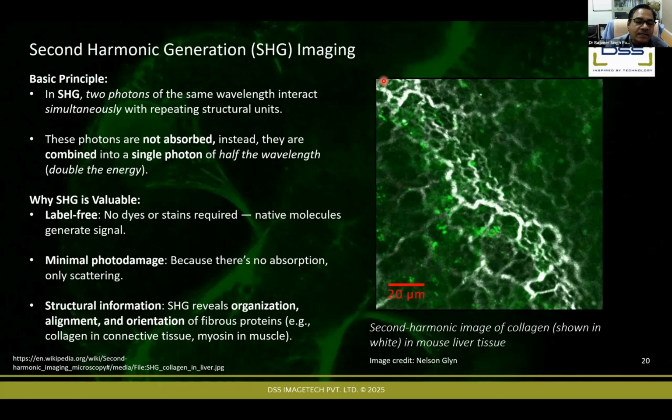Yes, that's what I actually wanted to know. Because as you said, collagen we can see, but suppose I'm cutting an artery and I'm seeing different layers: collagen, laminin, and maybe a certain endothelial cell layer. Those three layers, can I differentiate by label-free? No.